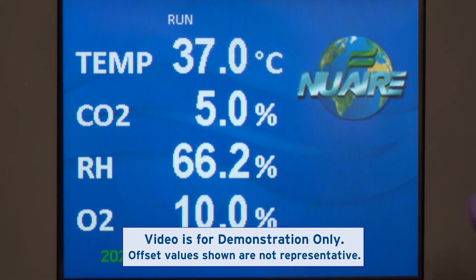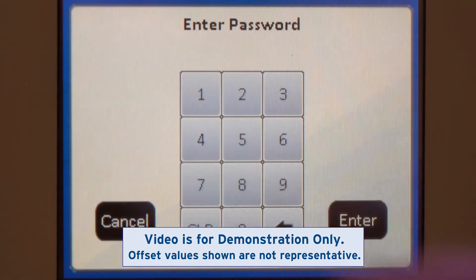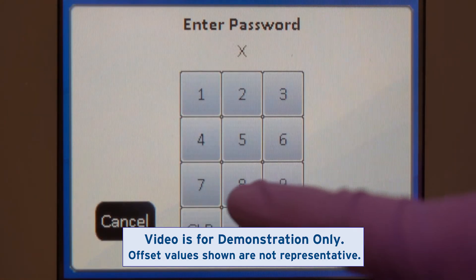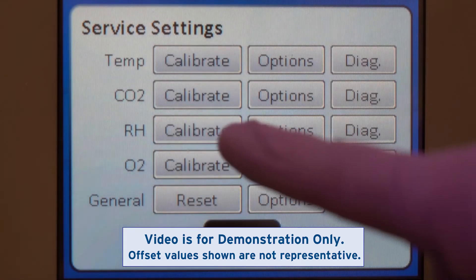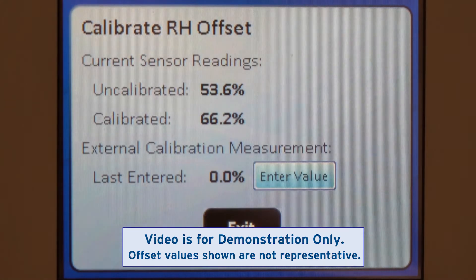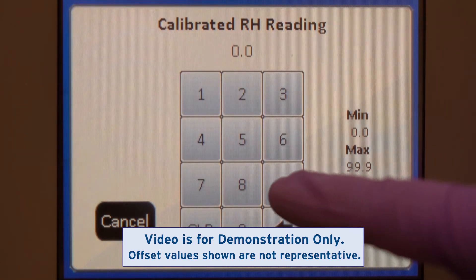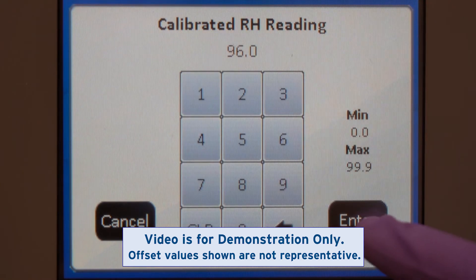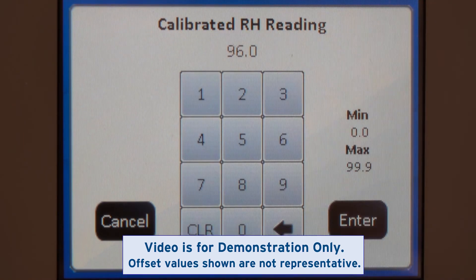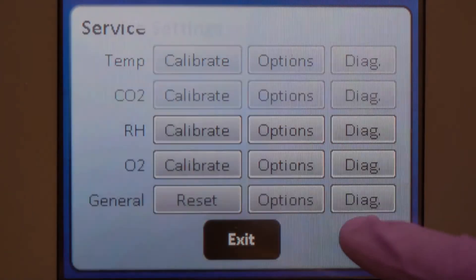Enter the Service Settings menu to reach the calibration screen. Enter 96% as the calibrated RH reading. Save your calibration and exit back to Service Settings.